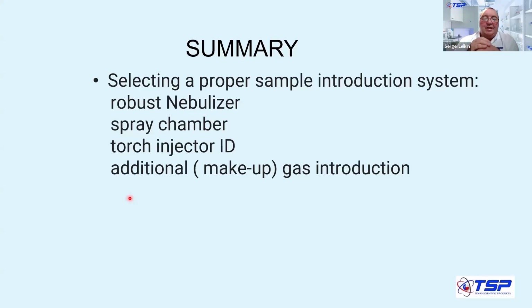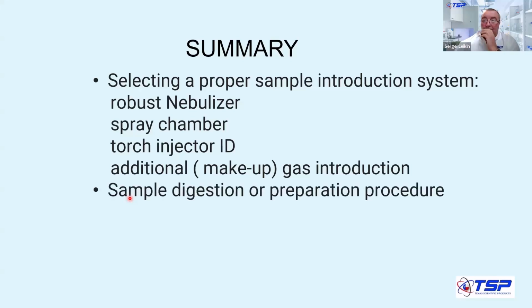And then, as I mentioned, additional or makeup gas introduction is very, very beneficial. If you have a procedure that involves sample prep, it can be tuned and optimized. For example, in the case of the oil samples, I forgot to mention that these samples are solidified at room temperature, so you have to heat them up. People are heating them up to loosen them and then making a dilution with a solvent.